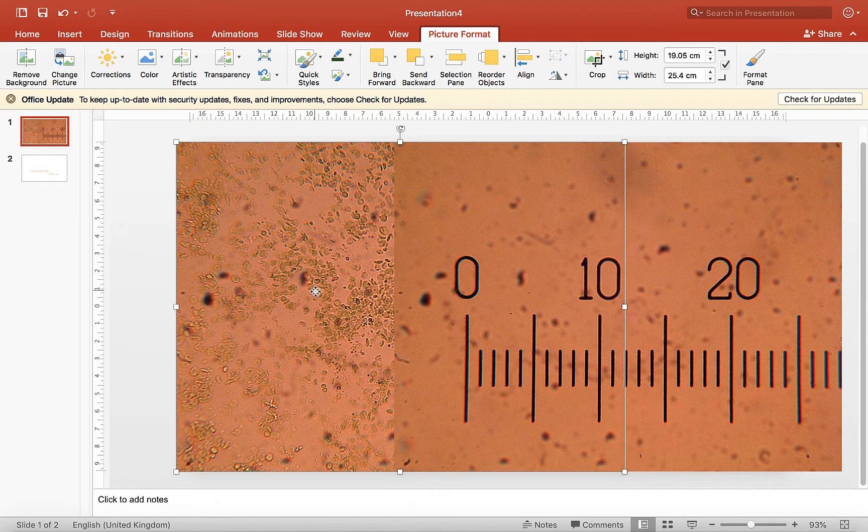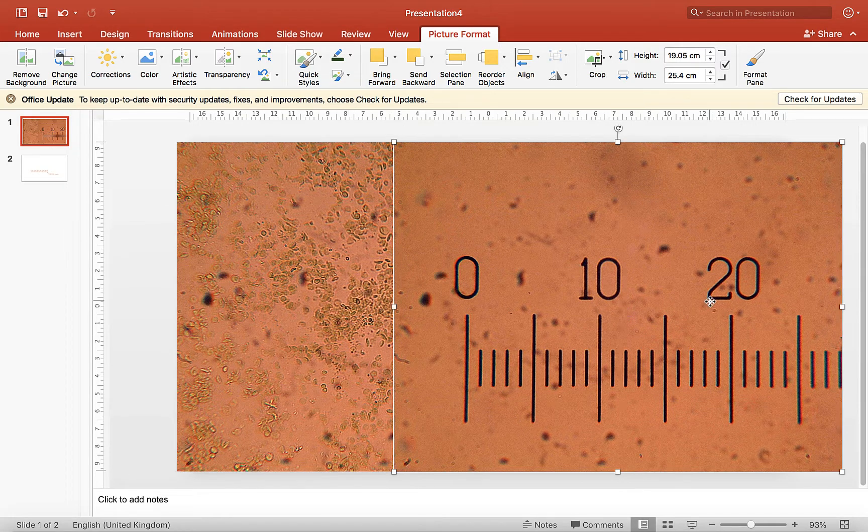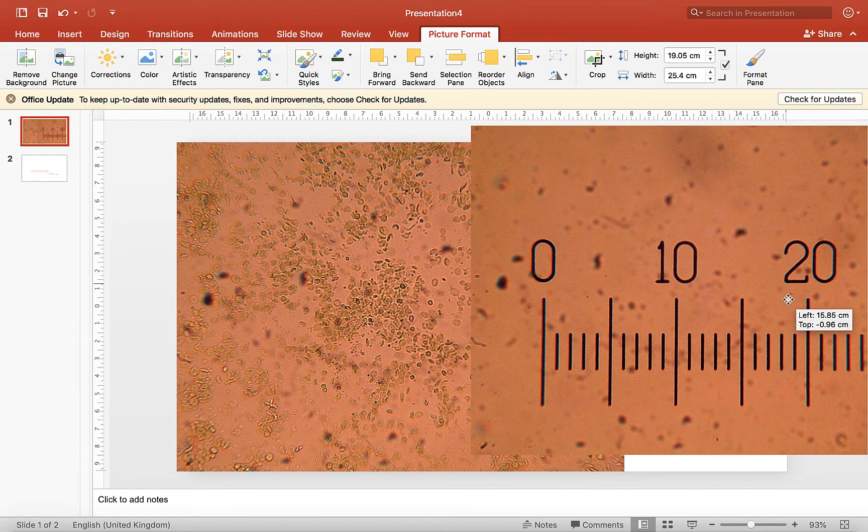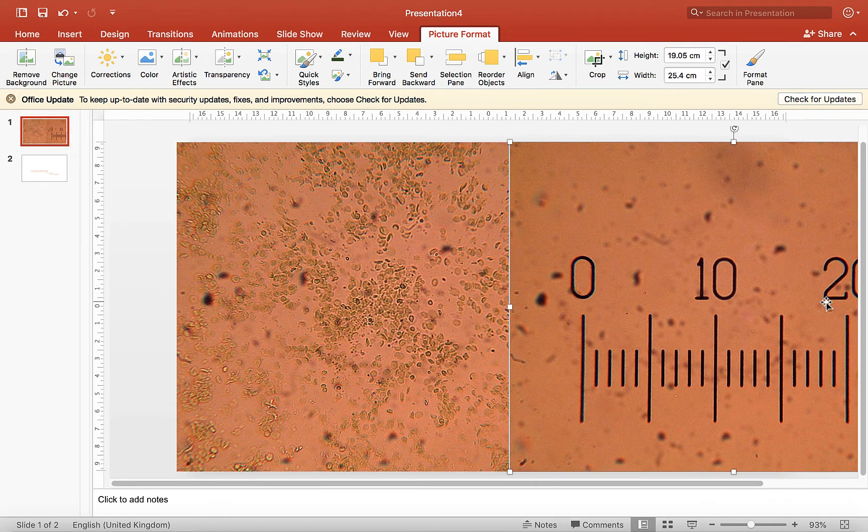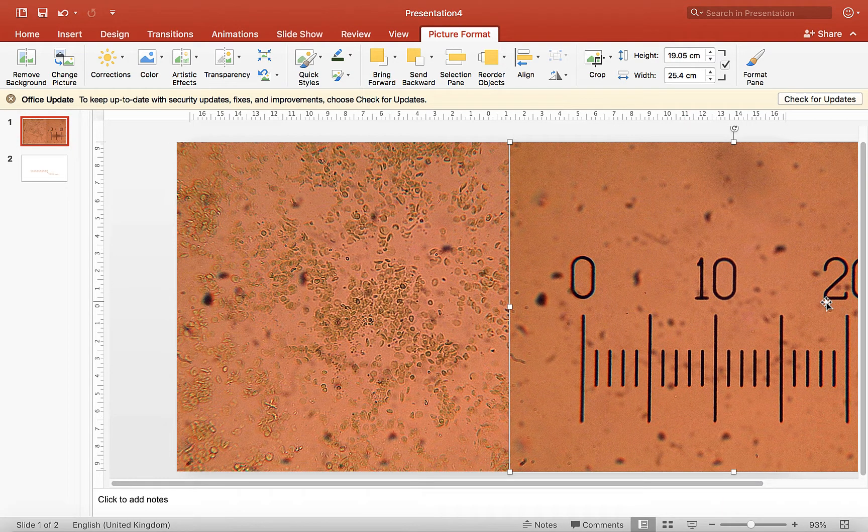So you can see the chloroplasts in my image, and these are pretty mucky images, this microscope should have been cleaned before someone took these images, but it will still be good enough for me to show you what you need to do.